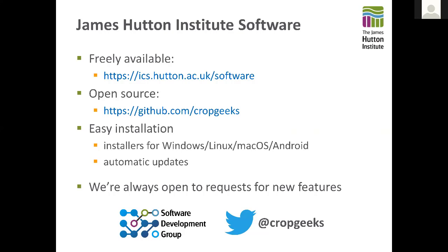Yeah, I mean, we can chat offline about options around that. I have no idea how much work would be involved in doing something like that. As I was saying, we spent an awful lot of time working on Tablet, and we really enjoyed doing Tablet at the time. But our focus more recently has been on the plant breeding side of things, which is why we've come back to tools like Flapjack.